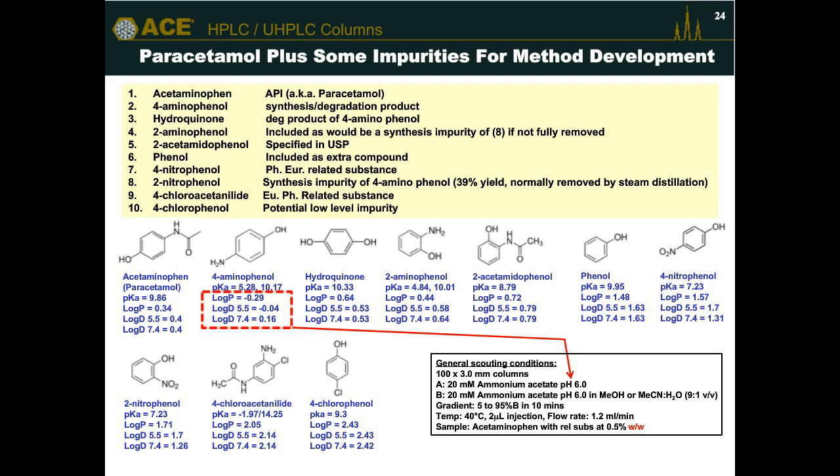So we weigh up the individual compounds, we dissolve them, we make them up, we filter the sample, we put it on the instrument, and we press go, and we walk away. Now, our instrument is set up as a screening system, so all the methods are already written, the sequence executes, and we get 2 sheets of paper that come out on the printer next to the instrument.